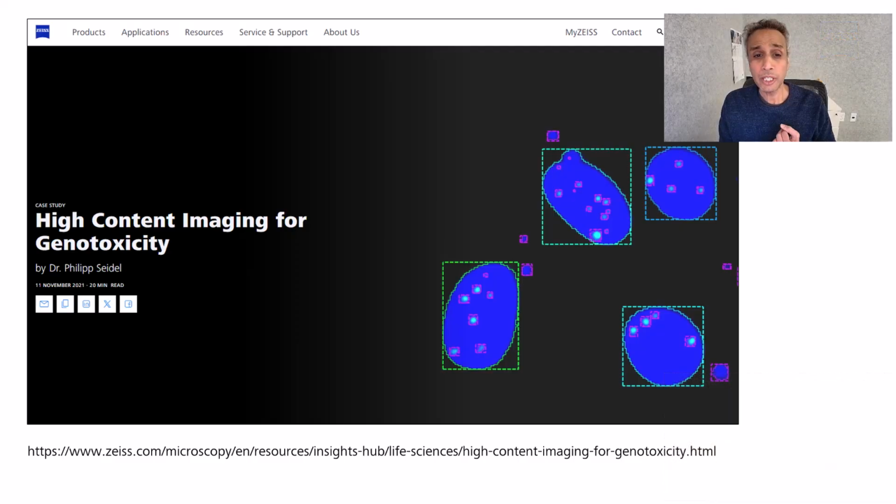And in the next few minutes, you'll learn how easy it is to set up an image analysis pipeline for this specific study by using a single field from a single well in a multi-well plate. And once this pipeline is set up, it can be executed to analyze multiple samples via batch processing in arivis Pro or parallel processing for scaled analysis in arivis Hub.